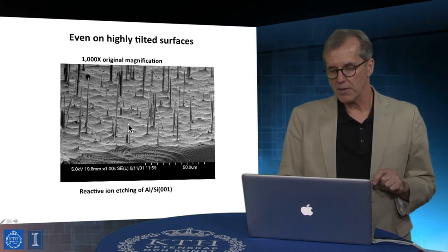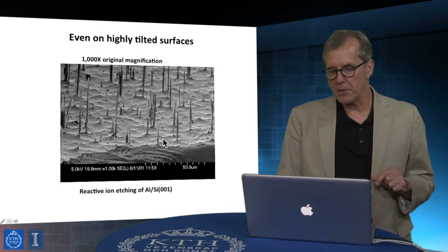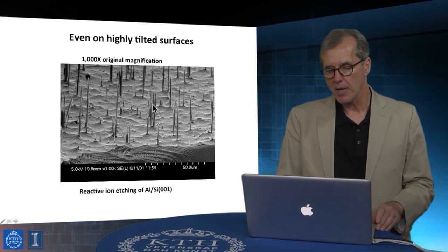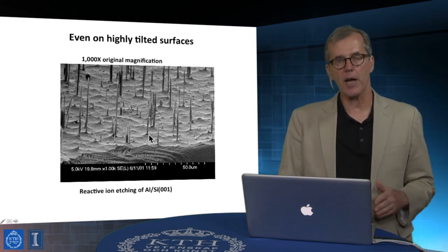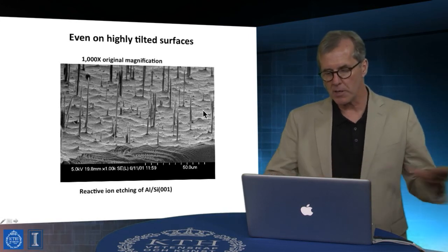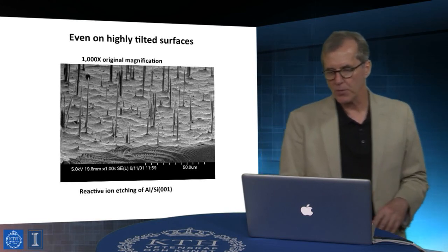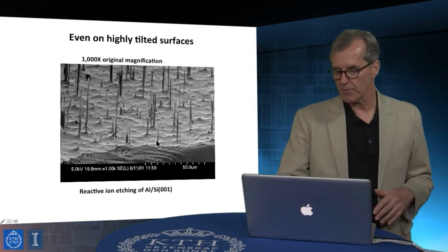And what you do is then anisotropically etch these sharp needle-like structures, because very small clusters of aluminum atoms that had been present at the original interface led to strong anisotropies in what should normally be an etching technique that would completely erode the sample surface. All right, and that's a kind of beautiful example of high-resolution imaging with incredible depth of view.